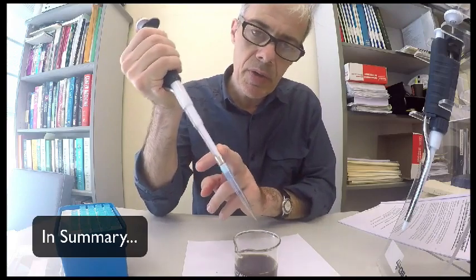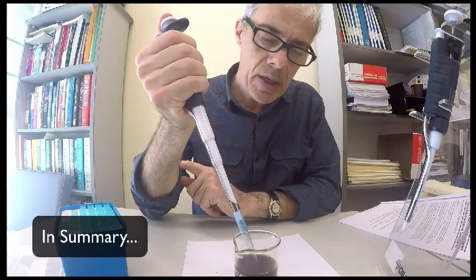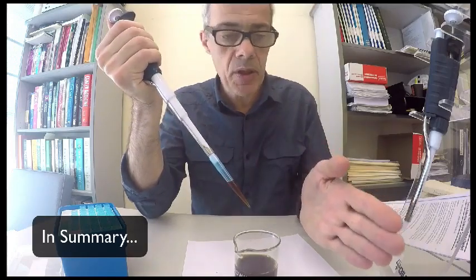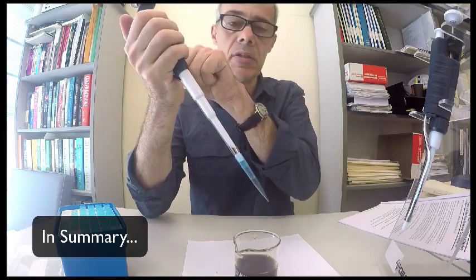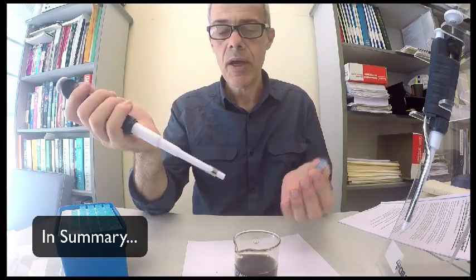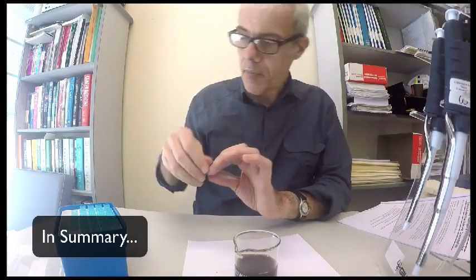So I go down to the first stop on the pipette here. I then immerse and slowly draw up the solution. I then go to the other thing I'm dispensing into, and I dispense the solution into that. And then I use this other button here to eject the tip, so that I can dispense the tip into a waste container, not into my hand. And again, keep the pipette upright whilst you're pipetting to avoid any backflow into the pipette itself.